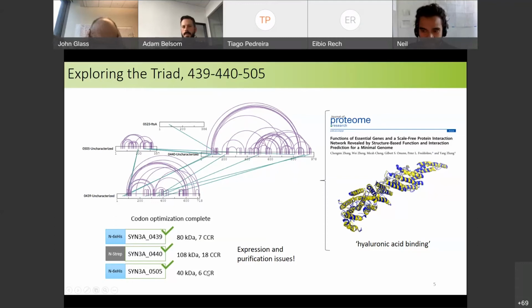And we set about trying to express these proteins, to clone and codon optimize them, before we knew of the existence of the Free Genes project. And coincidentally, two of these genes are not in that project, in those 398 genes. So it's good that we still persevered with them, but it was a lot of work, because to optimize them for expression in E. coli is challenging.